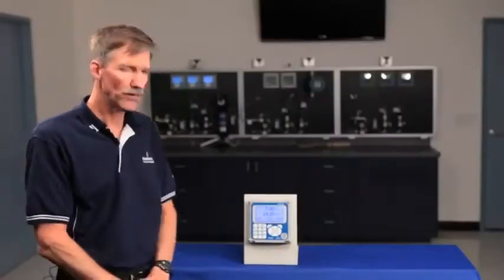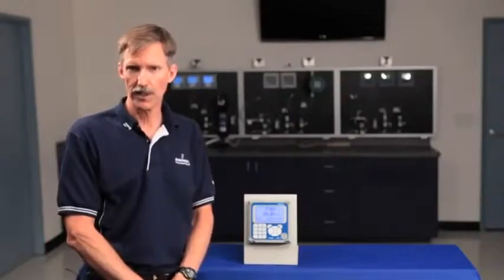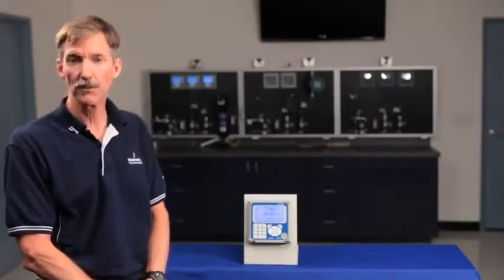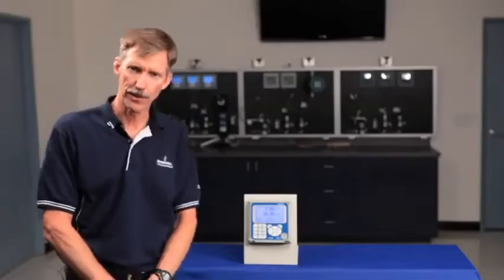These are a few of the features of the Model 56, which is engineered for fast start-up and ease of use in mind. Thank you for your time.